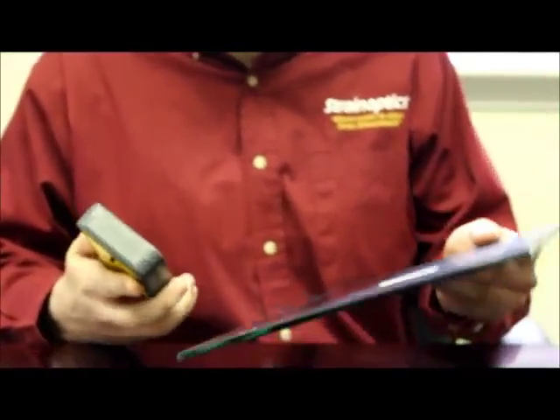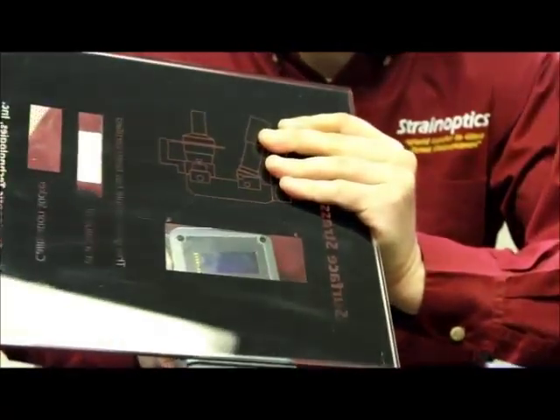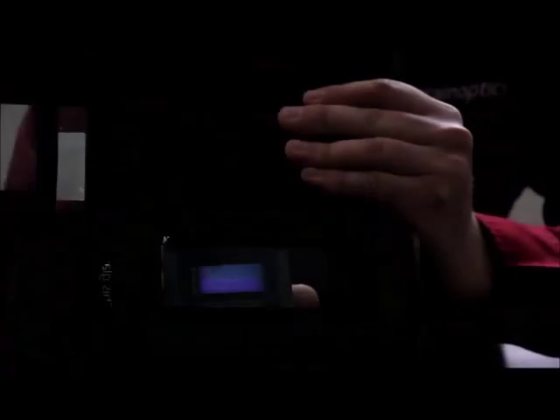The first step is to determine which side is the tin side of glass, because the GASP only operates on the tin side of glass. We have our tin side detector that is supplied with every GASP instrument. Turn it to the ON position and place it against the glass that we plan to measure. Look through the opposite side of the glass for a cloudy, milky haze that is produced by the UV light touching the glass. When we see that, we know that the side that the UV light is touching is in fact the side that has tin on it.